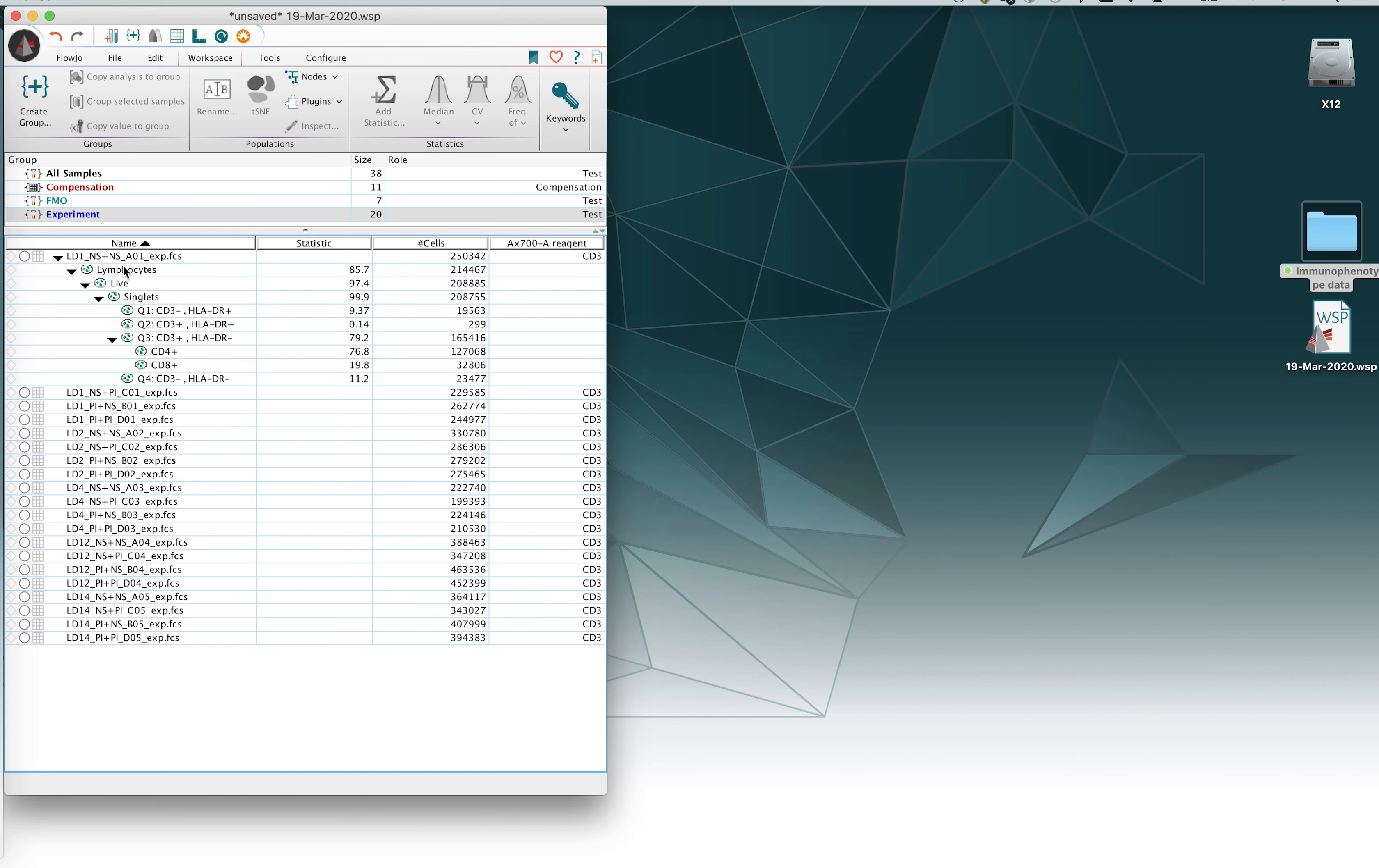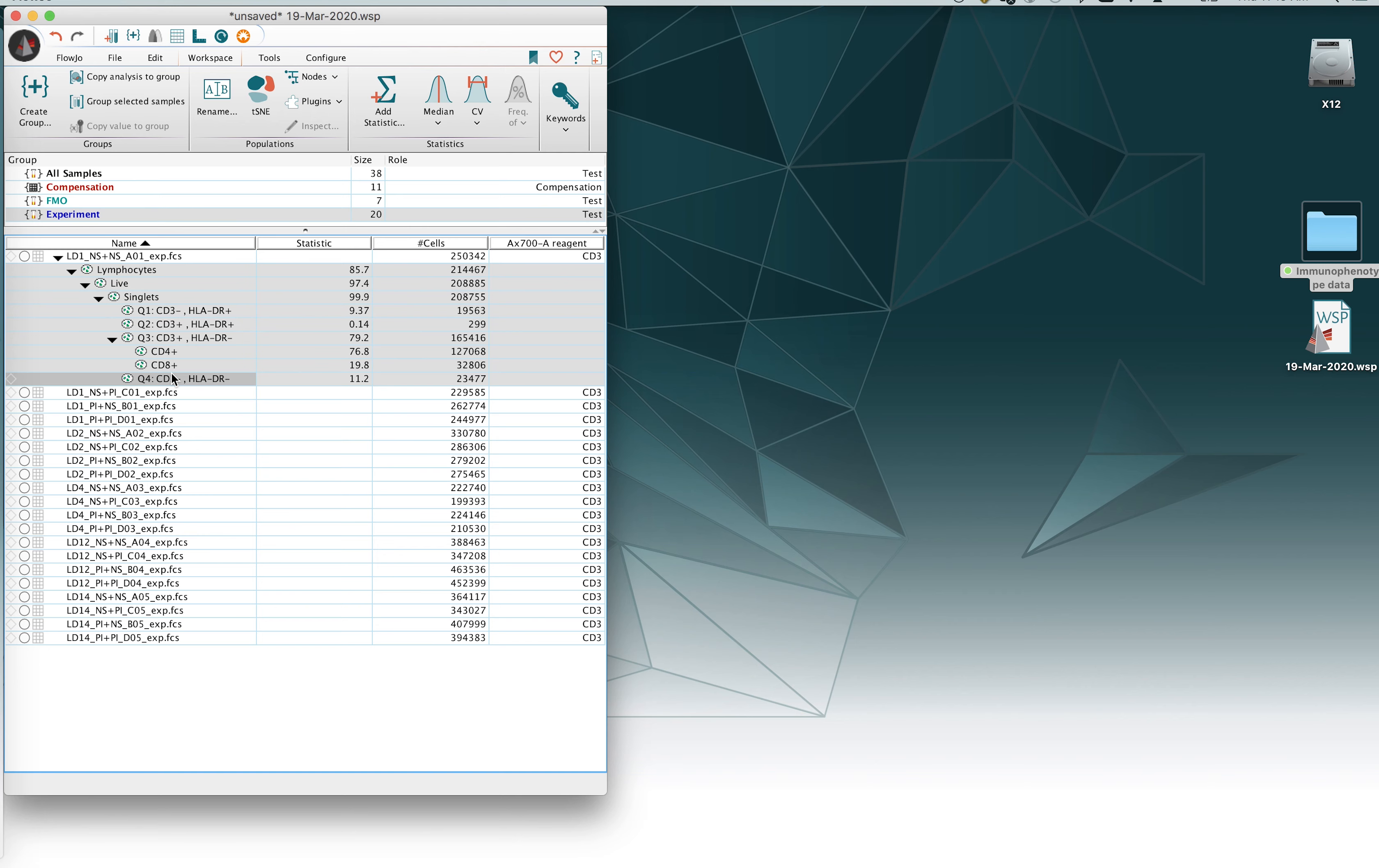In the workspace here I have a series of test files and I have a series of gates underneath one of those files. The hierarchy is shown, highlighted in gray, and what I would like to do is I want to copy this information to the rest of the files that I have in the workspace.